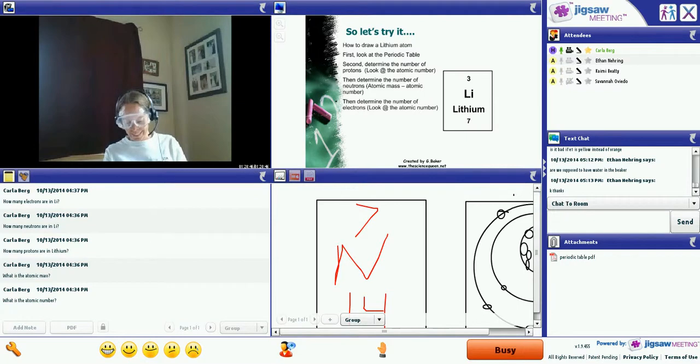In well D1, there was an excess of 3 drops of copper nitrate. There are 4 drops of copper nitrate and 2 drops of potassium iodide.